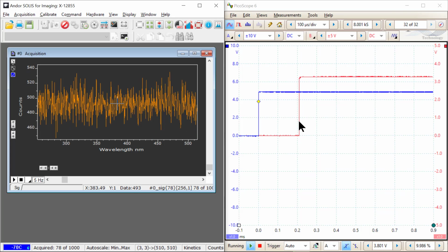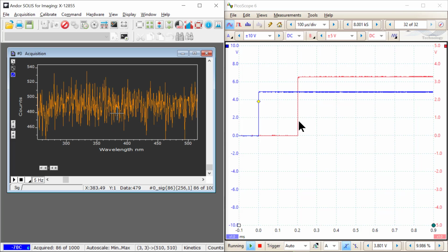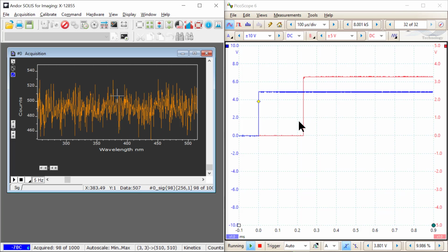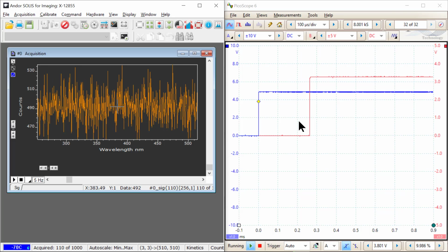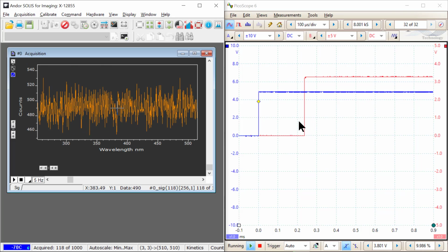If you're not using a cleaning cycle, and we have options for that depending on the camera, oftentimes that's not a problem if you have the light exposure under control through other means, shutters and so on. And if we're not really worried about building up thermal charge, dark counts I should say, over some long wait, then you can usually do without it.